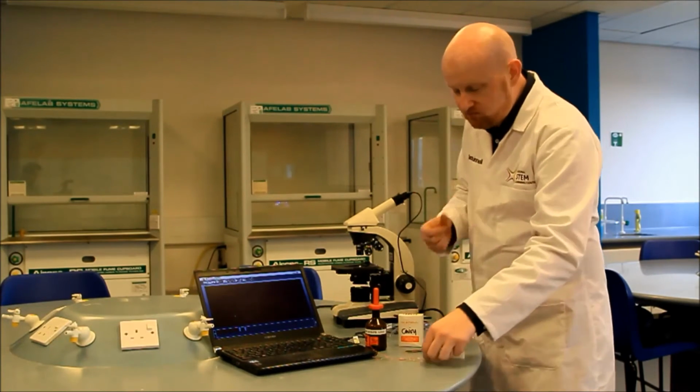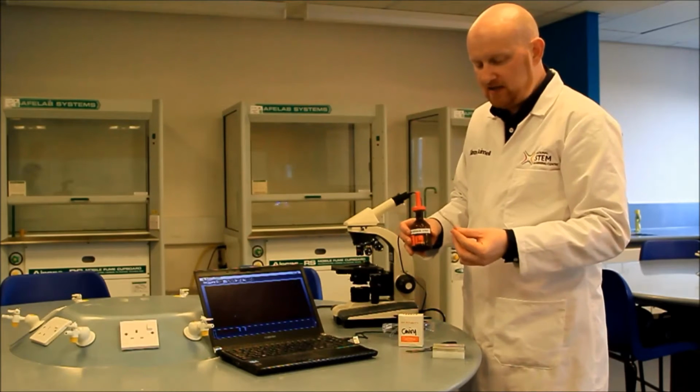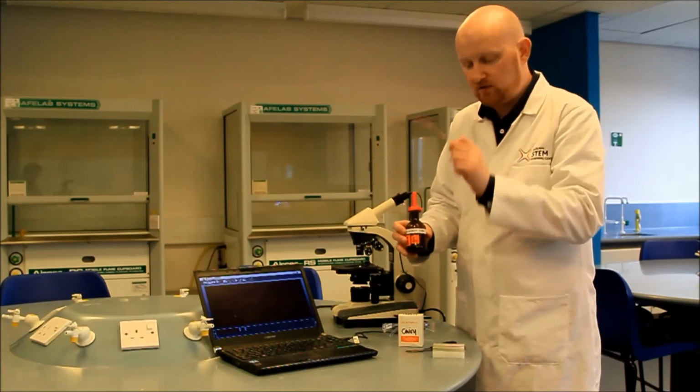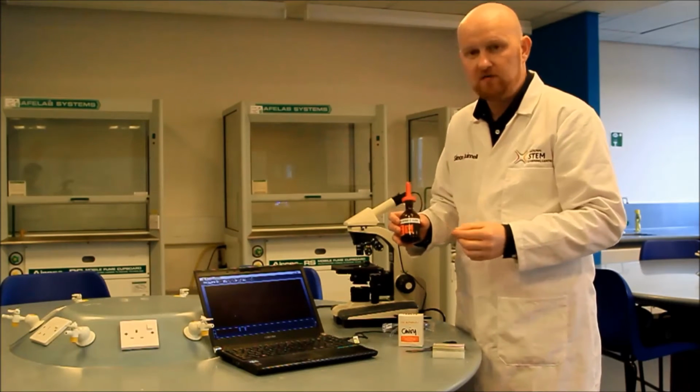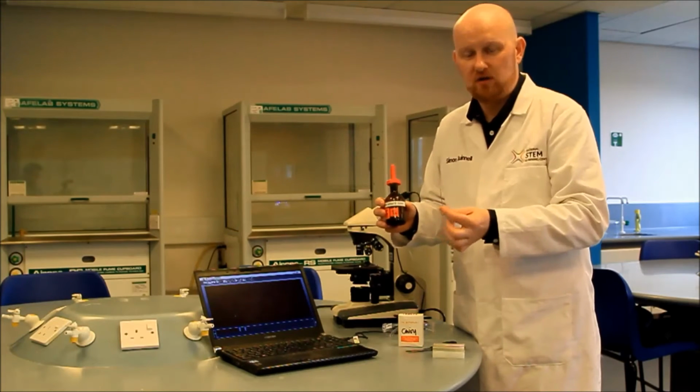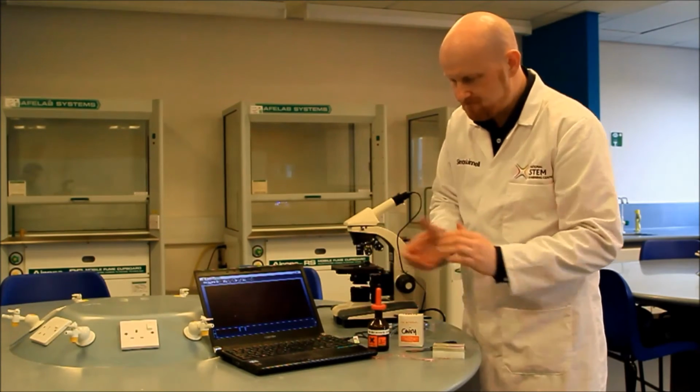This reaction is all about displacement, and it links into the reactivity series. So we have copper that's more reactive than our silver here. The copper will knock the silver out of the solution, so we'll have the silver crystals growing, and we'll end up with copper nitrate as our liquid.